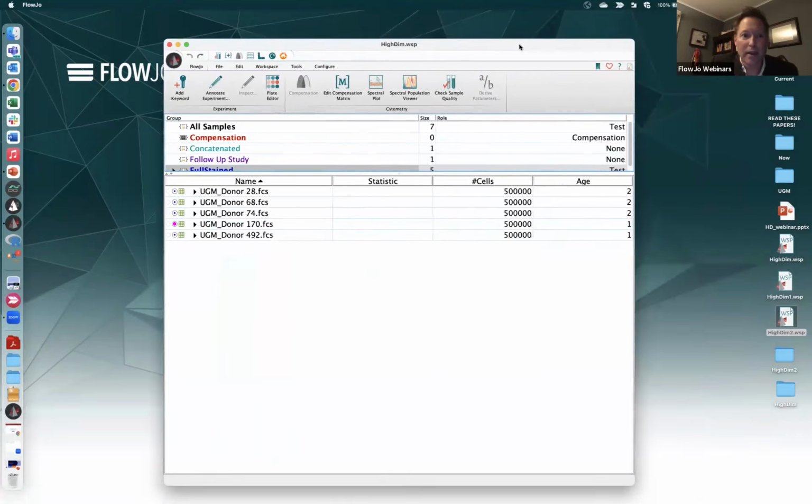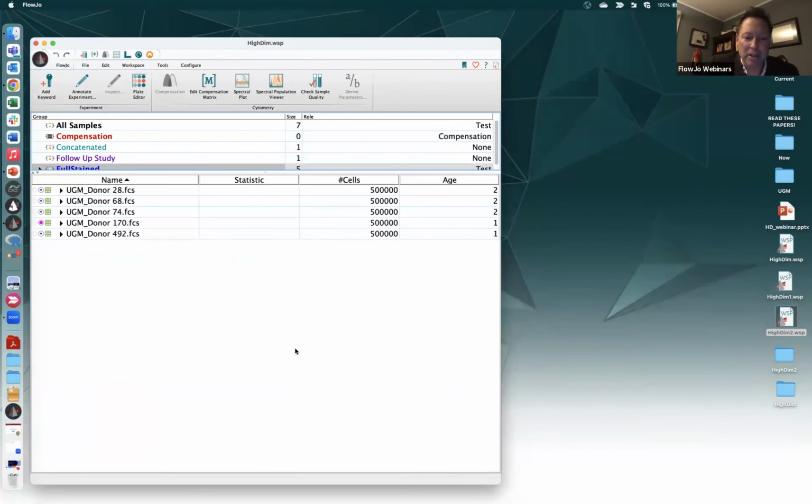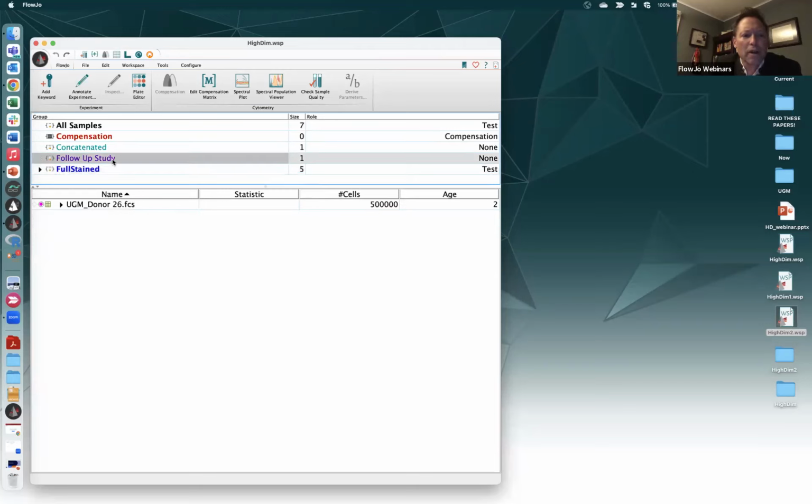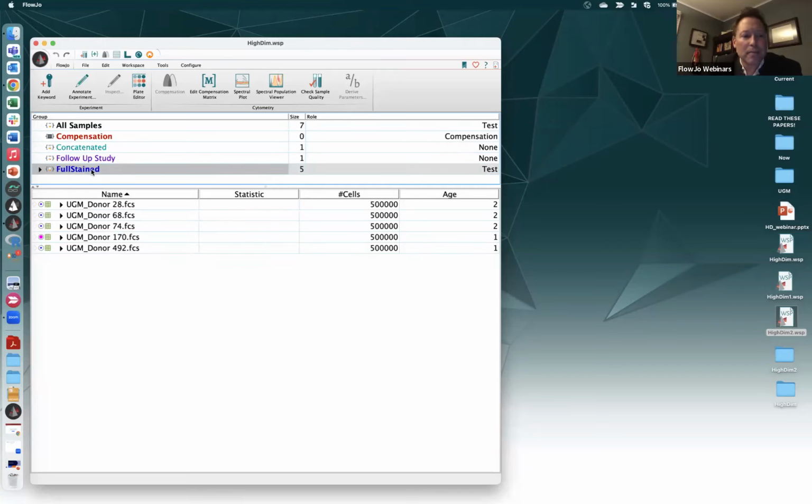Okay. So I have pre-calculated much of this. It's a webinar. We can do this cooking show style where I say, and then you would click the button and wait a little bit, and we don't have to wait then because no one wants to have to wait while we watch things calculate. But the gist, I've got a series of donors here that are full stained with my full panel. And I've set one aside up in a group I called follow-up study.